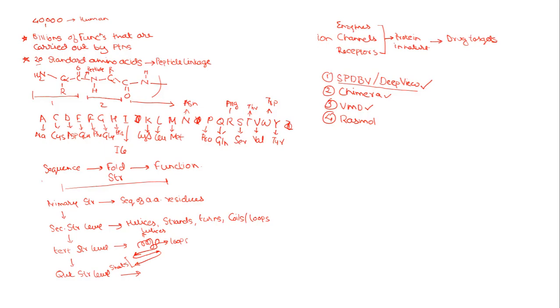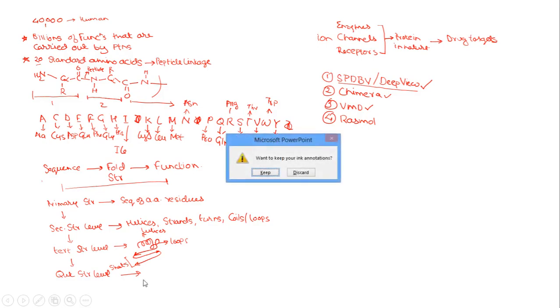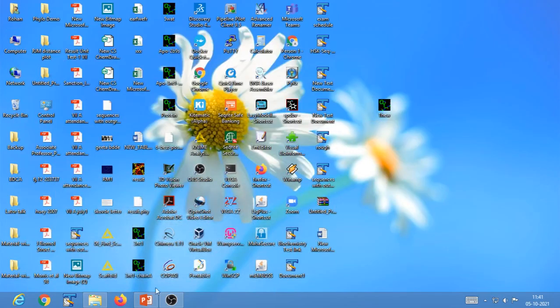Okay, so let us now begin with our practicals. Today's session, I would be dealing with a very basic exercise. I would show you how we select and display the different parts of your proteins.